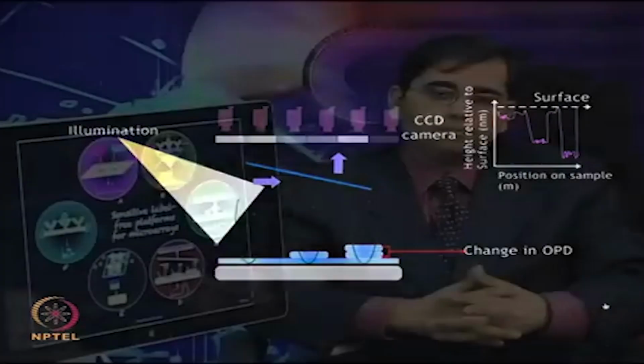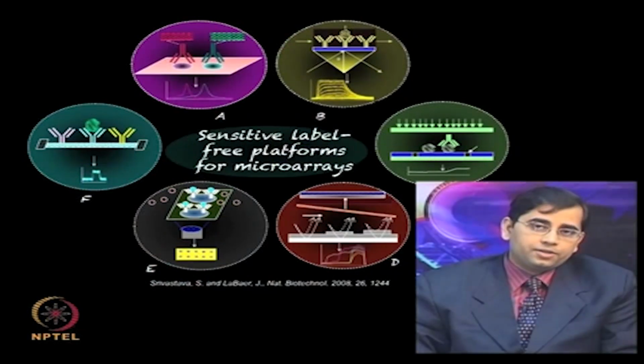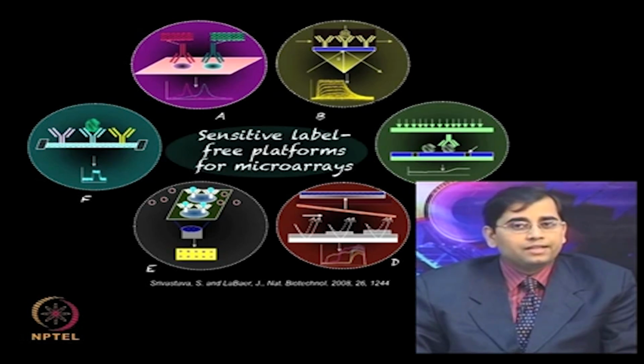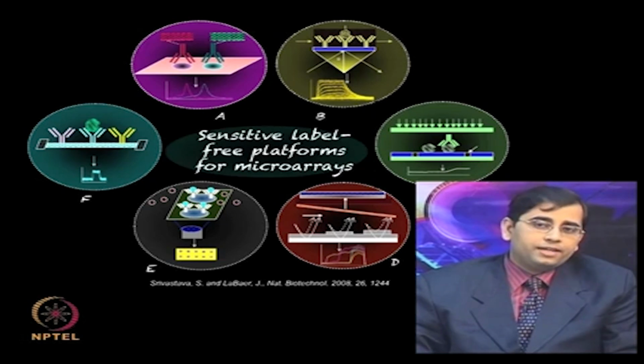biomolecular interactions. After discussing many label free techniques, in this slide I am just giving you an overview of several sensitive label free techniques which are currently promising for microarray application. Some of these we have discussed in detail. It was not possible to discuss all of this in detail, and also there are some nanotechnique based label free techniques which we will discuss in the subsequent lecture.